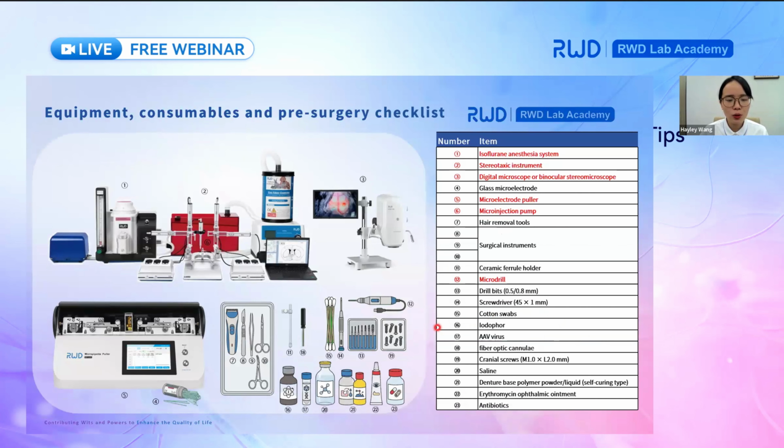Based on the principle of fiber photometry, the system needs an implanted optic fiber to deliver the excitation light and collect fluorescent signal from the target brain region. For this reason, a stereotactic surgery is usually required before the recording experiment. In most cases, the surgery is also used to deliver the virus sensor in the target brain region.